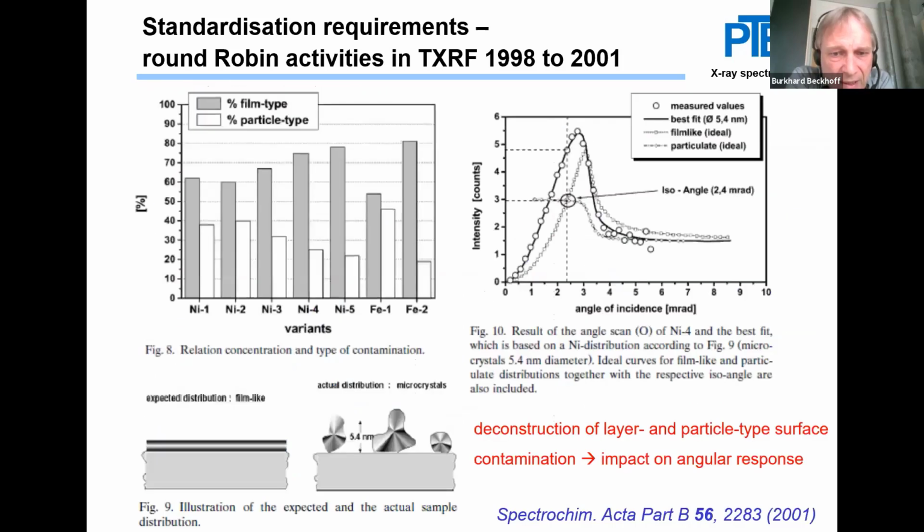What's interesting is, depending on the crystallization, and I think I learned this from Hagen-Stossnach, how important it is to have the same kind of salts regarding the spatial distribution of the various contaminants, and they have an impact on the angular response, even under perfect TXRF conditions, because you're getting a different kind of extra standing wave field.